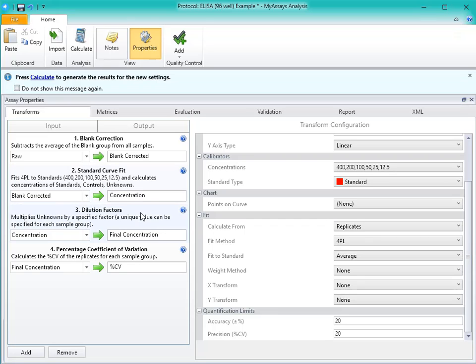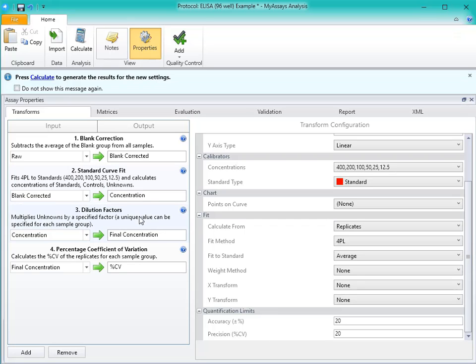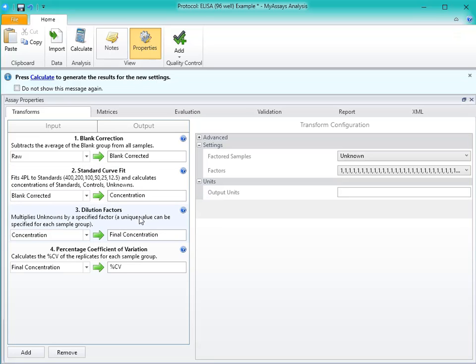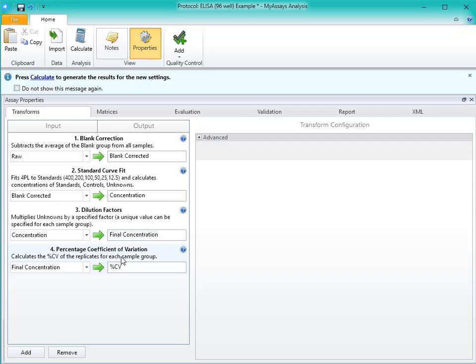Next, you'll see the Dilutions Factor Transform, which will contain the same information as the Dilution Factors tab. Finally, we have a PercentCV Transform, which will calculate the percentage coefficient of variation between the replicates of our samples. This is a useful measure of precision and can be used to identify sample preparation issues.